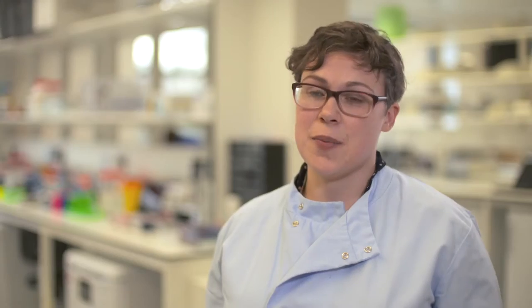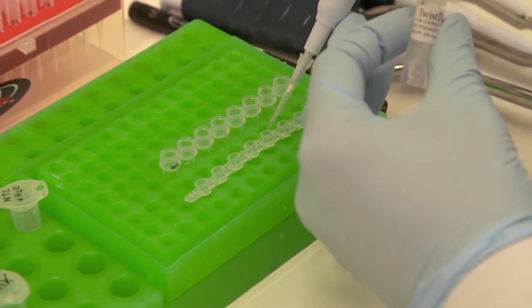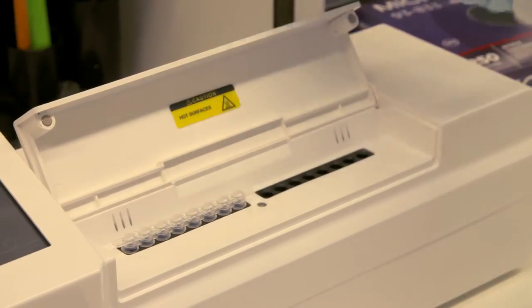RPA reactions are really simple to set up and run. You just open the box, take the reactions out, add your template, add your primers, put it in the incubator, and 10 minutes later you should have an answer.